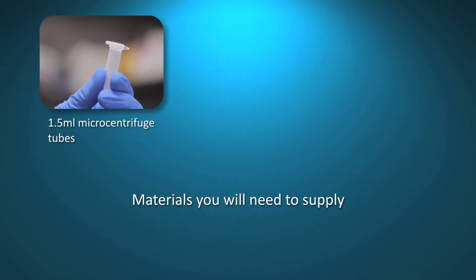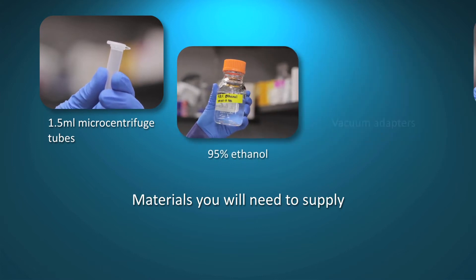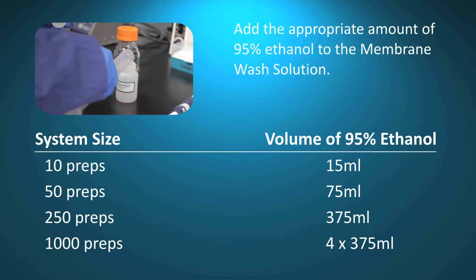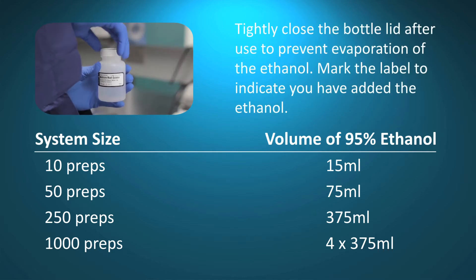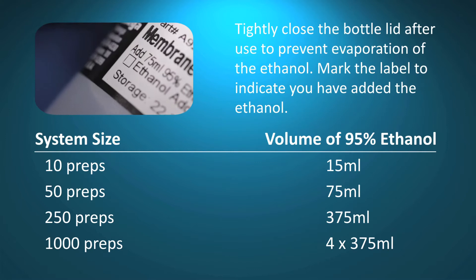To begin, gather 1.5 milliliter micro centrifuge tubes, 95% ethanol, and vacuum adapters. Add the indicated volume of 95% ethanol to the membrane wash solution, then record this addition on the bottle label. Tightly close the bottle cap after each use to prevent evaporation.